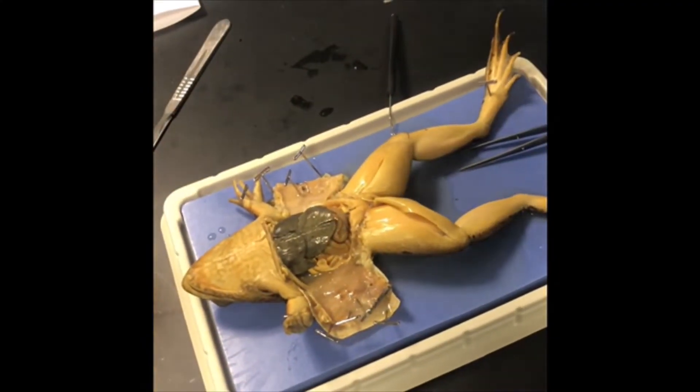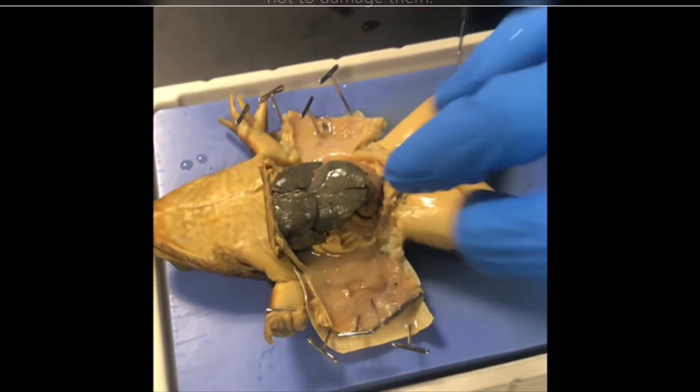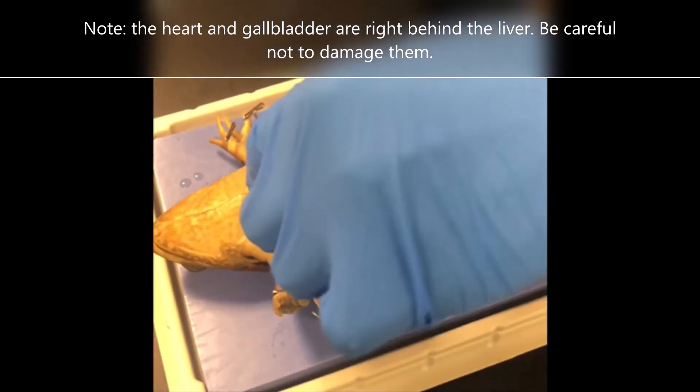The liver is a large, prominent, dark brown organ in the middle of the trunk. Remove the liver carefully — snip with your scissors and put it on your placemat.